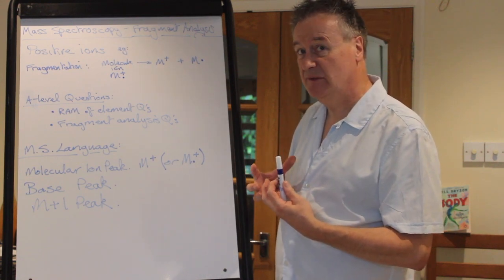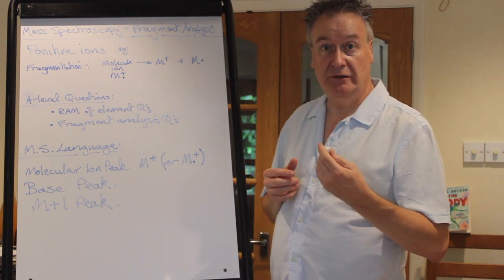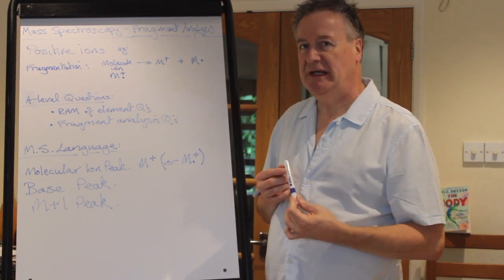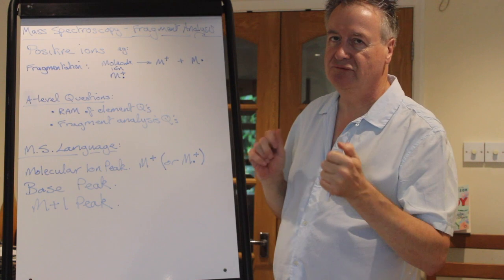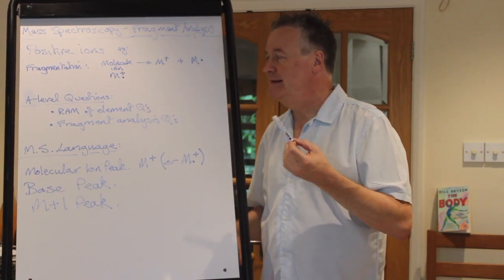It's going to be a little bit of difficulty in what we do, really, I think, because firstly, it's probably new to you, but more importantly, it's got a bit of challenge in it, shall we say. So, its title's up there, Mass Spectroscopy Fragment Analysis. I'm going to remind you a little bit about mass spectroscopy before we go too far.